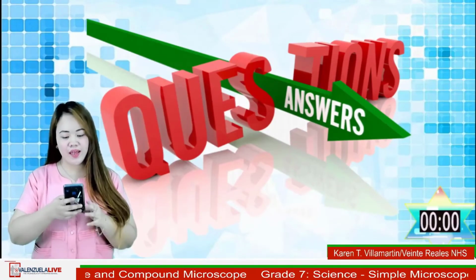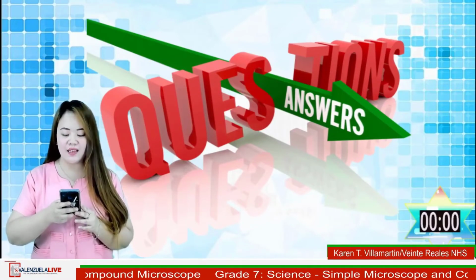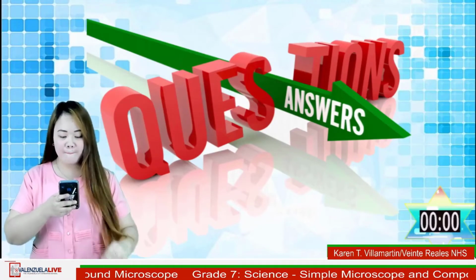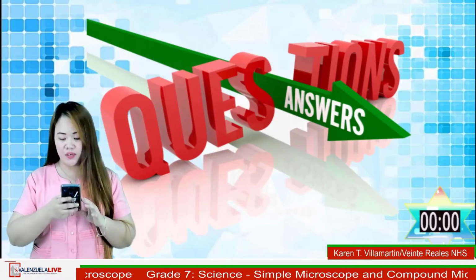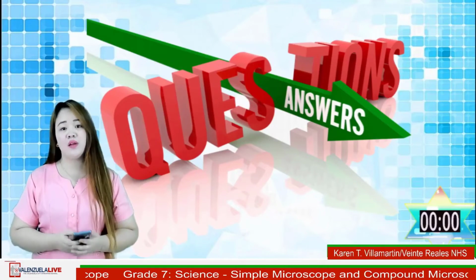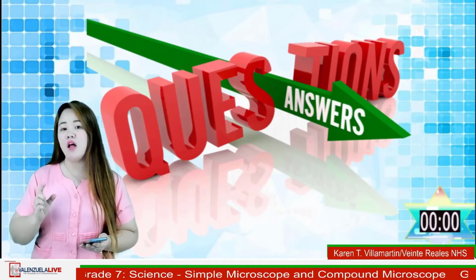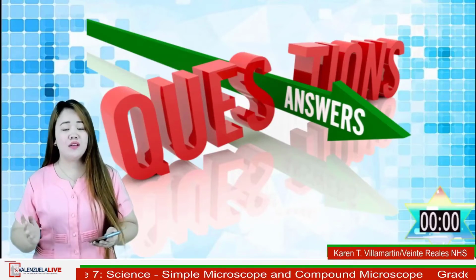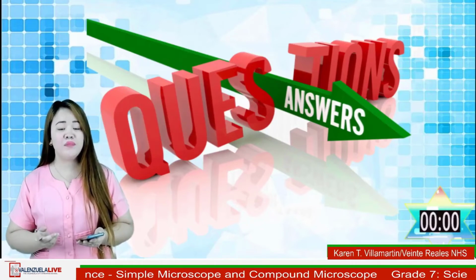Okay, so we got a question from a student in Paso de Blas National High School. Ma'am, can you please repeat the difference between magnification and resolution? Okay, so magnification is the ability to make small objects seem larger, such as making a microscopic organism visible.